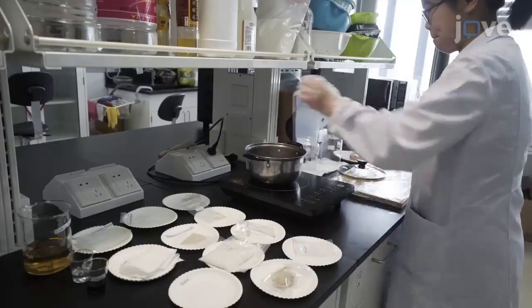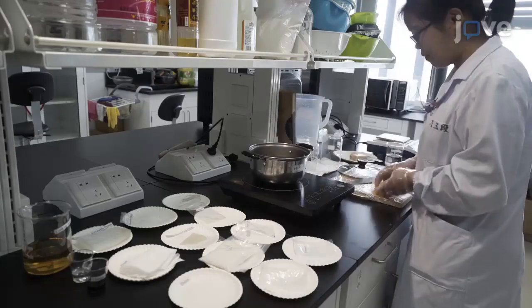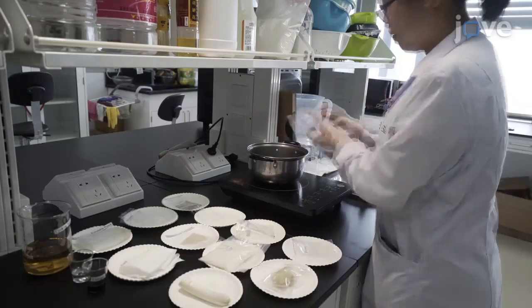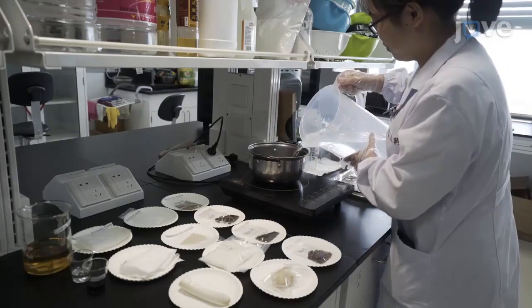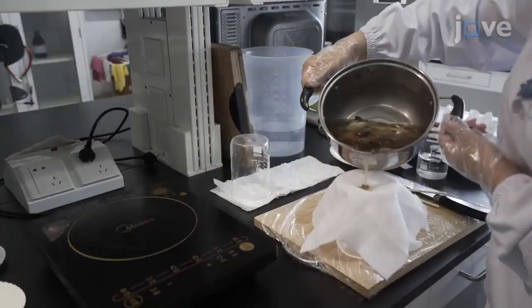To prepare the spice liquid, mix spices including 1.2 units of scallions, 1 unit of ginger, 0.6 units of star anise, 0.6 units of fennel, 0.3 units of green tea, and 0.3 units of pepper with 40 units of water. Boil for half an hour and collect the filtrate.